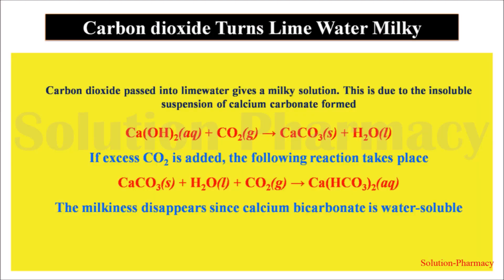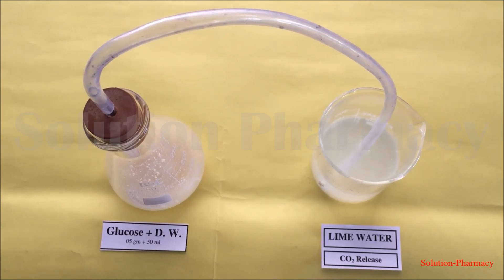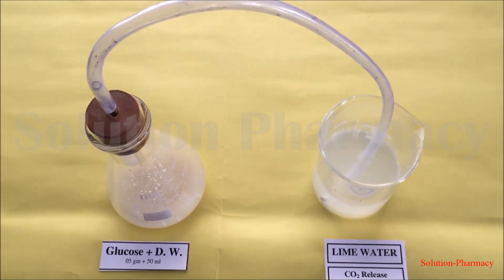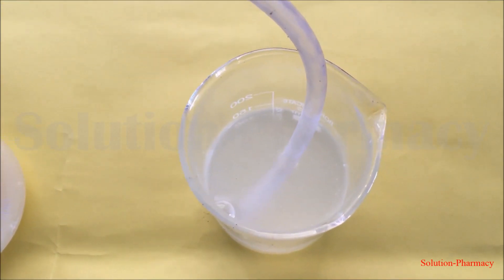Here is the reaction involved in the conversion of lime water into milky white water: calcium hydroxide aqueous, which is lime water, reacts with carbon dioxide gas and forms calcium carbonate. The formation of this insoluble suspension of calcium carbonate causes the milkiness. After 10 minutes, the transparent colorless lime water completely turns milky white.